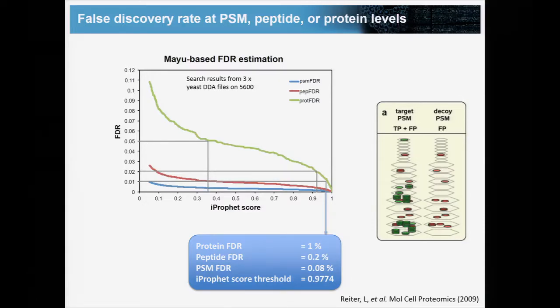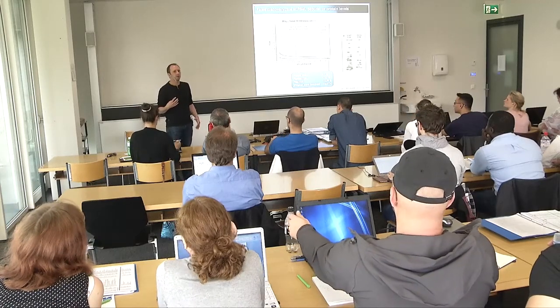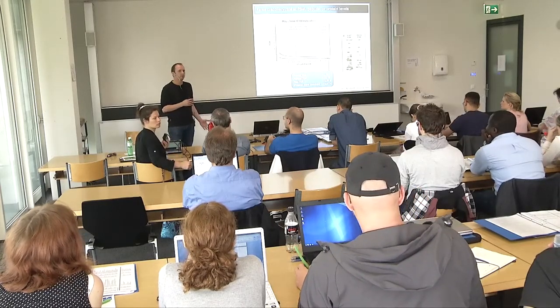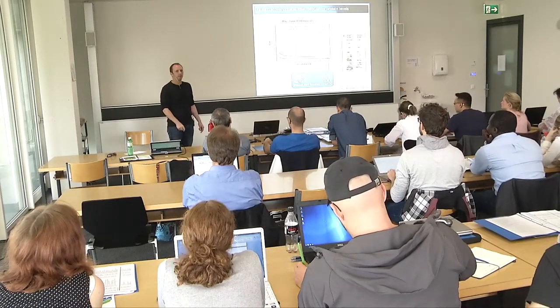So why do you care about protein level? I mean, you quantify peptides. We quantify peptides, but usually in most experiments, the end conclusion is made at the protein level, right? So there's almost always, except for some PTM studies or something like this, you almost always roll this up to a protein inference, so it will go back up to that level eventually after the SWATH analysis.